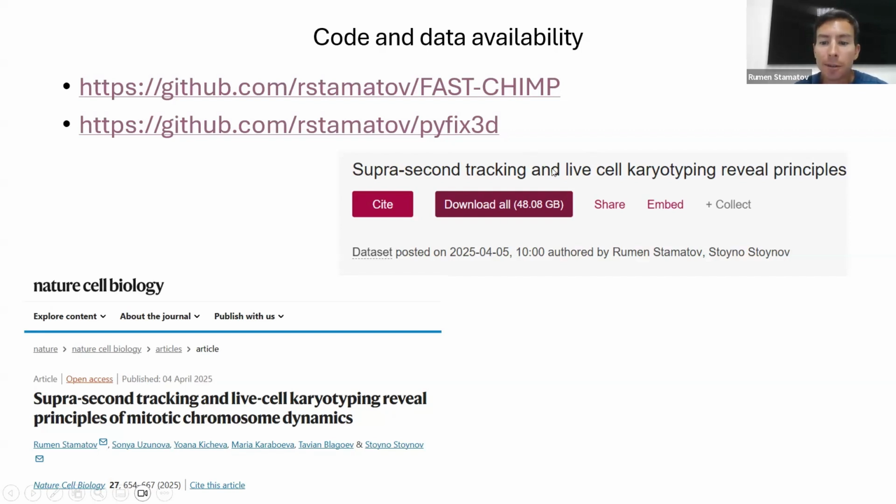We also have the different cells available. So all of the cells that we analyzed, their raw data paired with the segmentation masks, that anyone can use. They are in this Figshare repository. There is a link in the paper. So I imagine they can be used for many things. For example, anyone can train some other deep learning model, or they can look for patterns in the motion of chromosomes, trajectories, anything that we haven't thought about.